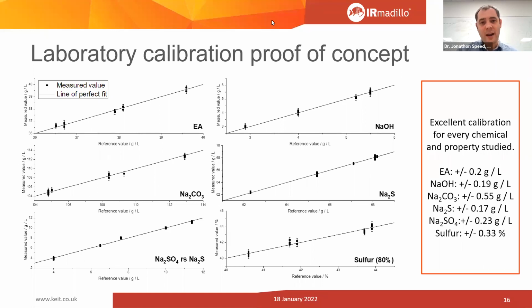And I actually went back and reanalyzed the last month's worth of data. And I can tell them the minute their catastrophic scaling event happened. And it's also when they had a very high TTA value. So something in the process went wrong. They were using the spectrometer to observe, but not to control, and they got a scaling issue. And so it was a problem.